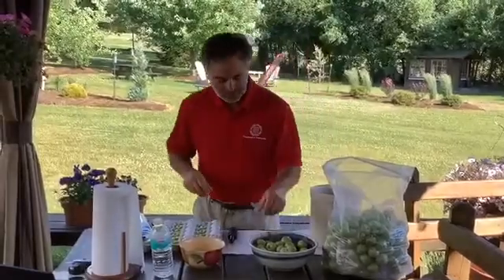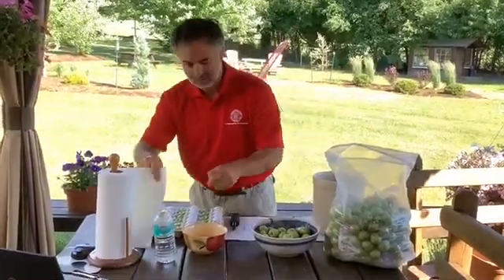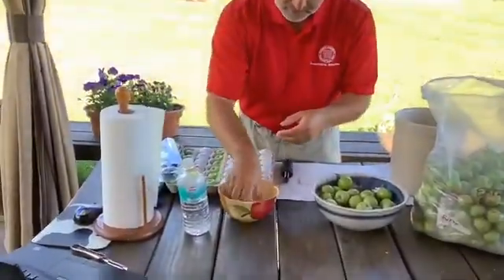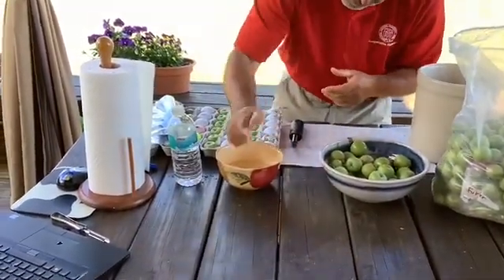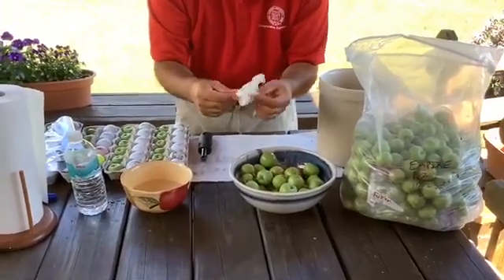So now I want to show you how to clean these fruitlets in case we have any residue of calcium or anything else. You're gonna have a paper towel like this one. You're gonna put it there in purified water. You're gonna squeeze it very well, and this is the paper towel that you're gonna use. Your hands are gonna be clean.